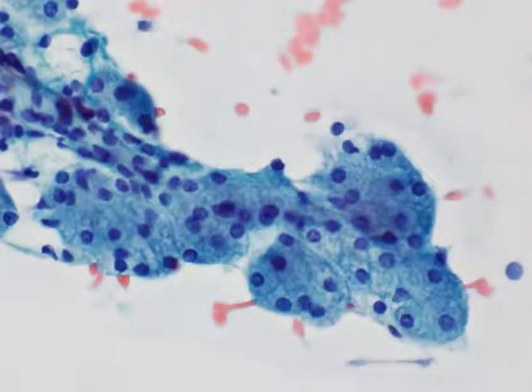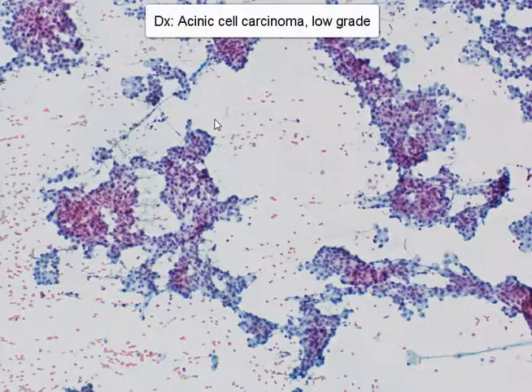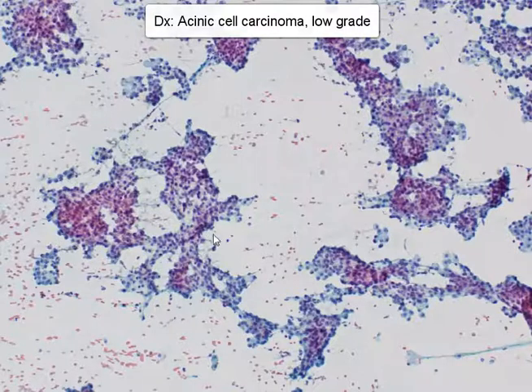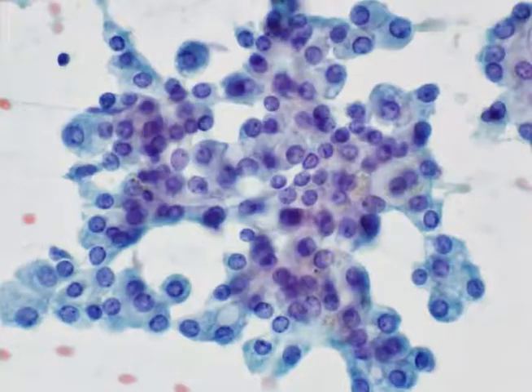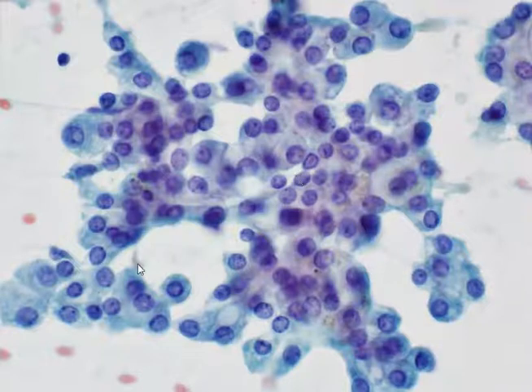To summarize, here is a cellular aspirate from an acinic cell carcinoma of the parotid gland — a fairly low-grade tumor in this instance. We can see that there are vague acinar formations, very regular appearing branching tissue fragments, and extremely uniform cells. On high power view, we can appreciate the eccentric round nuclei, the small nucleoli, and the abundant finely vacuolated to granular cytoplasm.